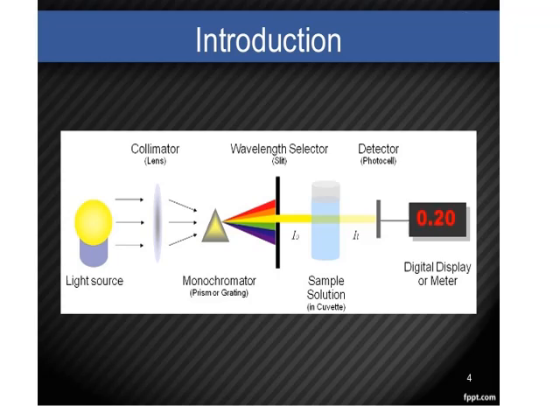The figure shows the spectrophotometer. Here, light from the light source, which is a halogen lamp, is passed through an entrance slit and incident on a concave reflector, which focuses the light on a monochromator or a prism to disperse the light. The selective wavelength from the dispersed light is obtained by taking it in the given direction, and then it is allowed to be incident on the reflector. From the reflector, the light beam is directed to the sample through a narrow exit slit.